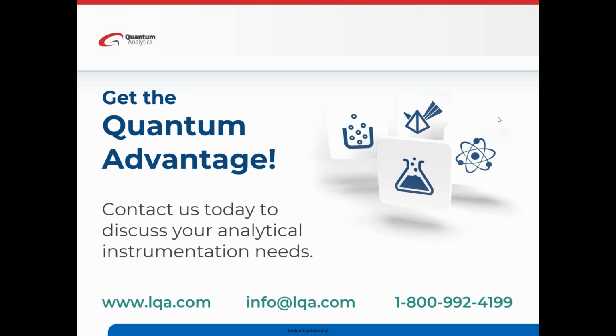Next question here is, how long does it take to image a tablet? So that's a great question. A tablet image with 5 microns per pixel over 13 millimeters in the diameter of a tablet takes about 9 minutes only to collect all those spectra, millions of spectra. And in that case, it takes, as I mentioned before, less than a minute to do the quantitative distribution analysis. So the whole thing, start to finish, is under 10 minutes with 5 micron precision.